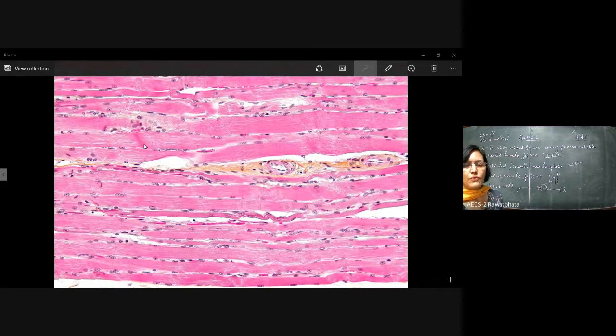And of course, here also the bands are very, very clear, light and dark. For example, dark and then light, then dark and then light. Same. From here to here, you can see this is a light band, then again the dark. Here also the dark and then the light. And here also goes the light. And even more clearer, the darker ones you can see. Here they are, for example, light and dark. Very, very clear.